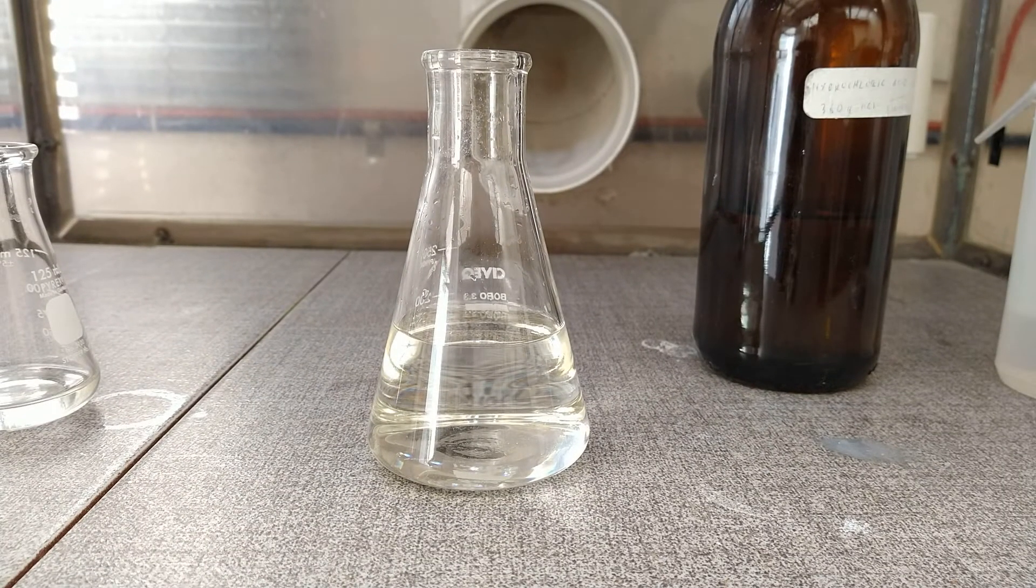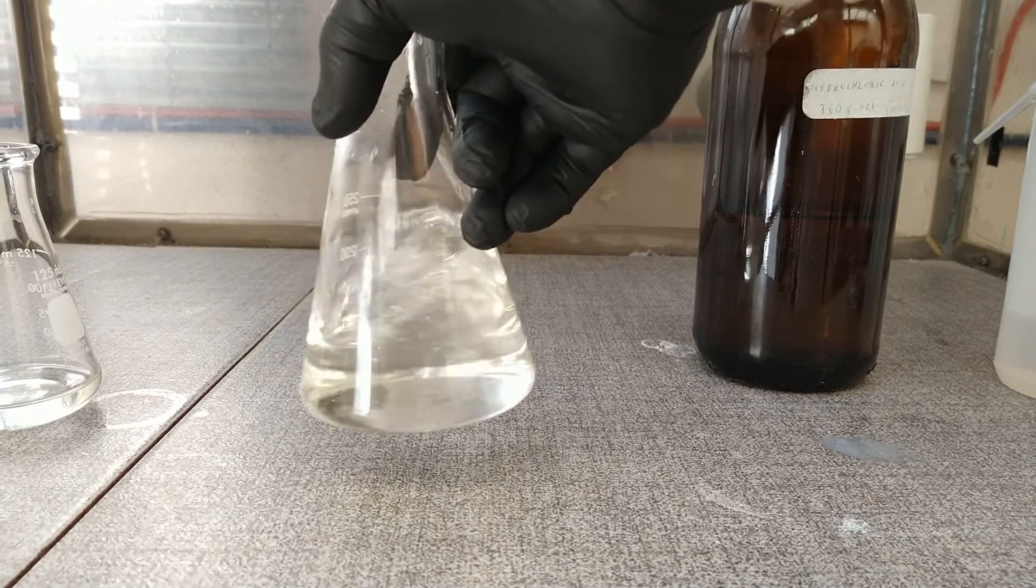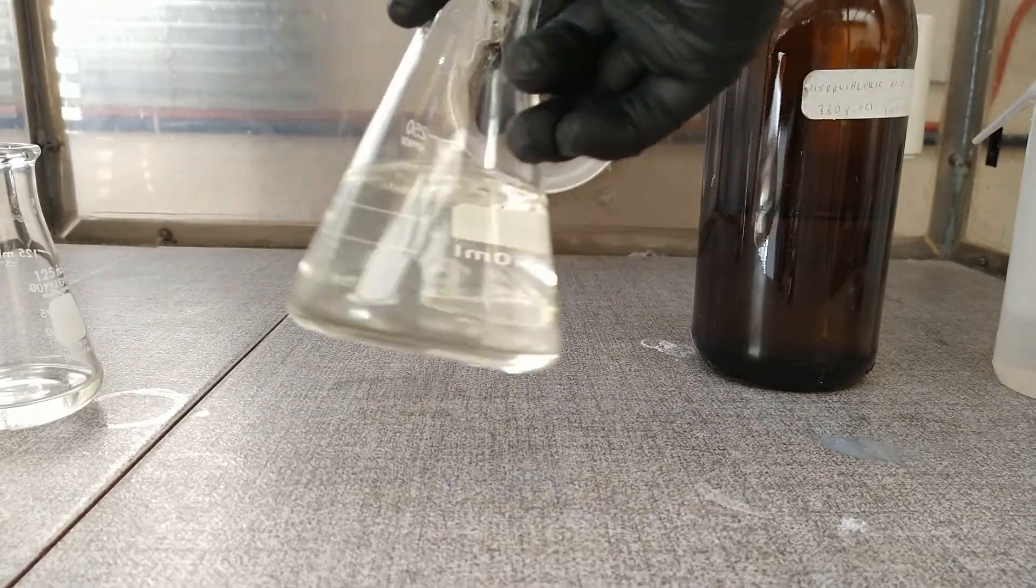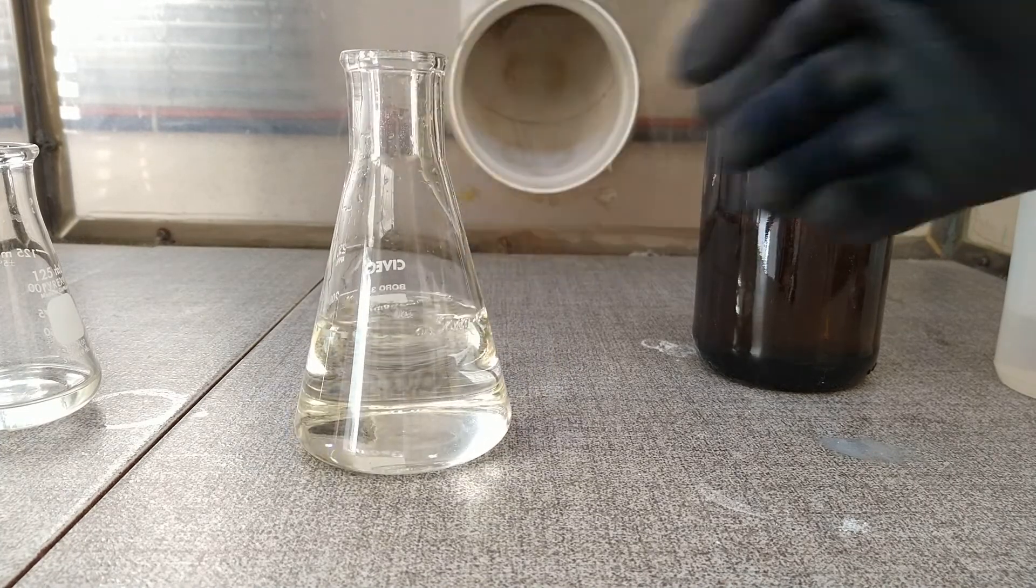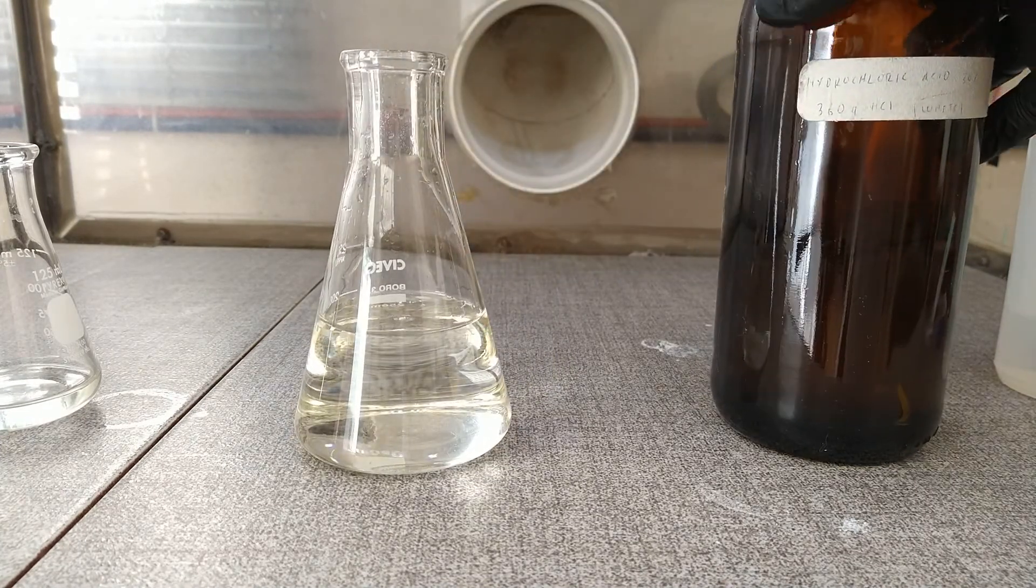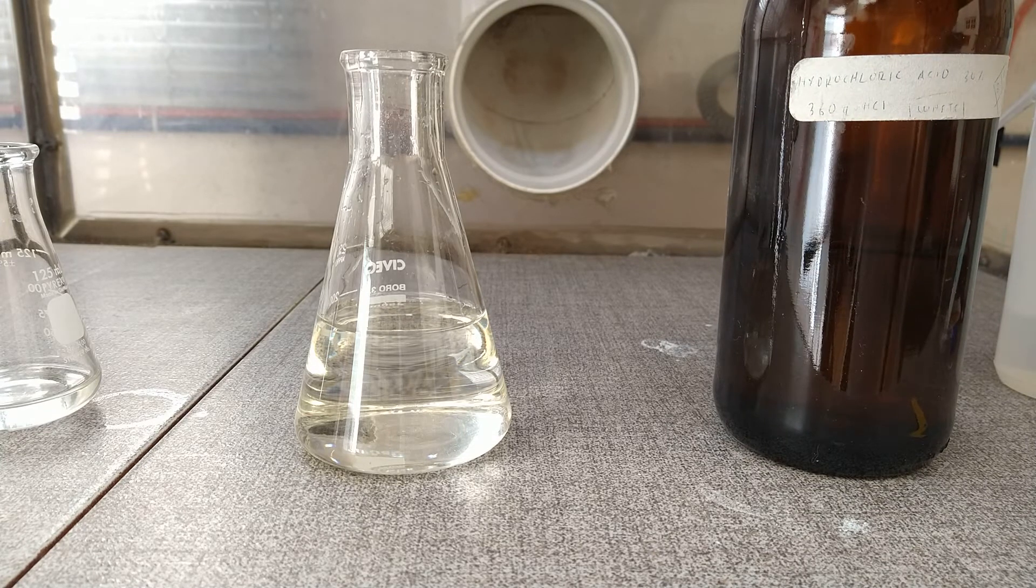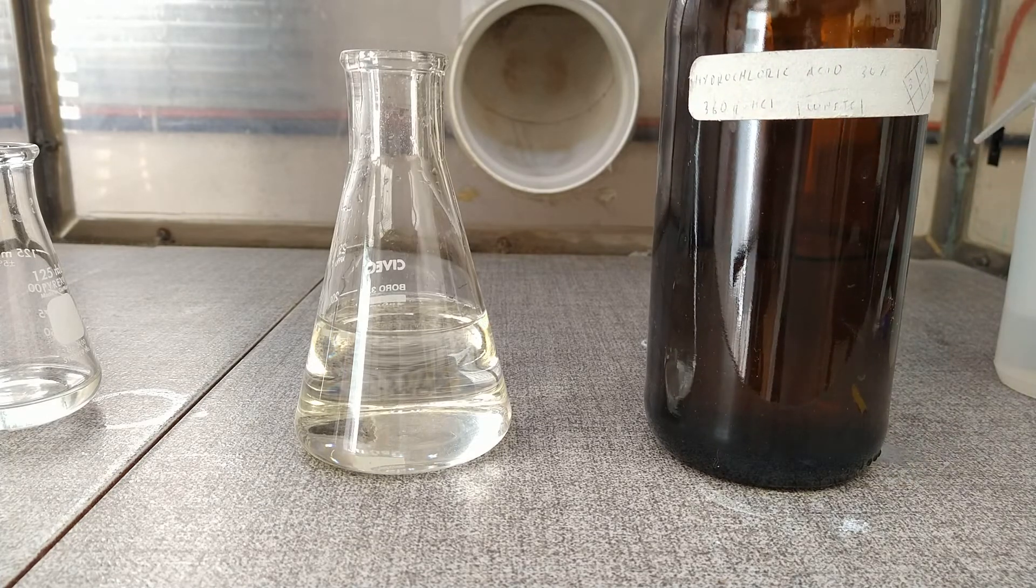Now that all the liquid has passed through the cotton filter, we are left with a nice clear solution of potassium adipate. In order to recover our product we need to make the solution acid again until around a pH of 4 or 3. Now we can add some concentrated hydrochloric acid.